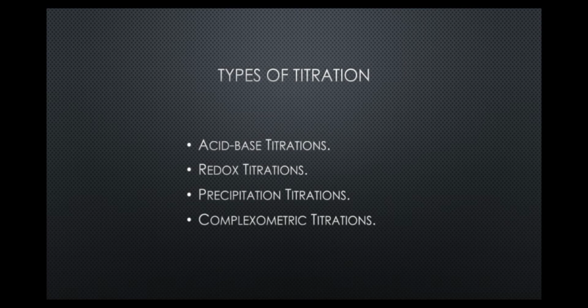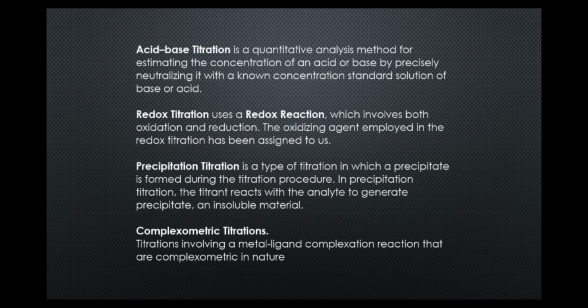So let's define the types of titration. Acid-base titration is a quantitative analysis method for estimating the concentration of an acid or base by precisely neutralizing it with a known concentration standard solution of base or acid.